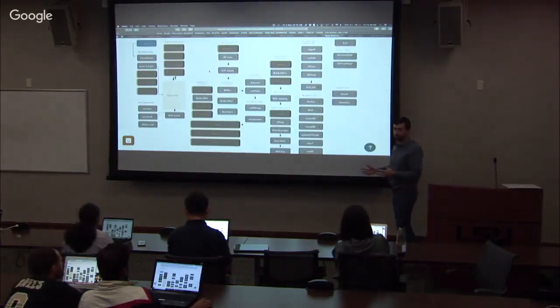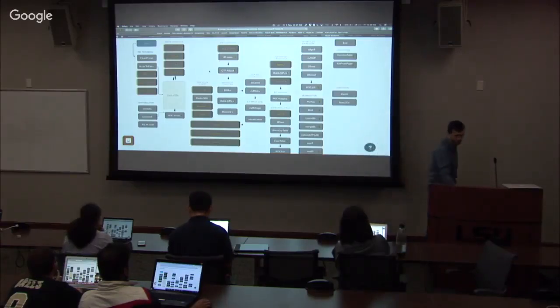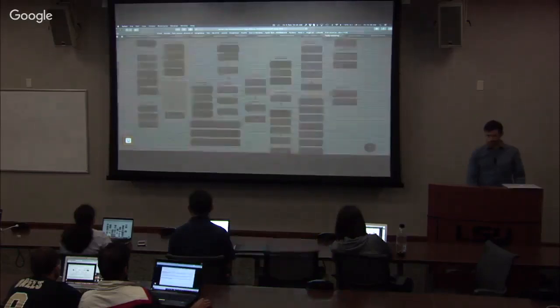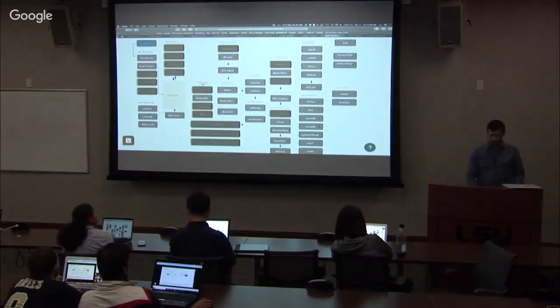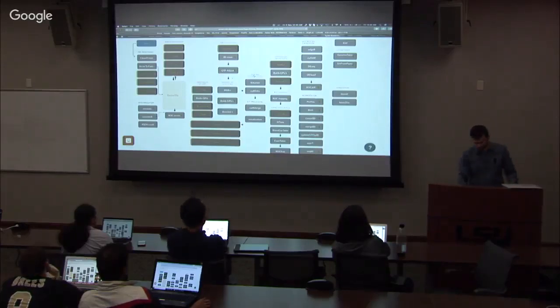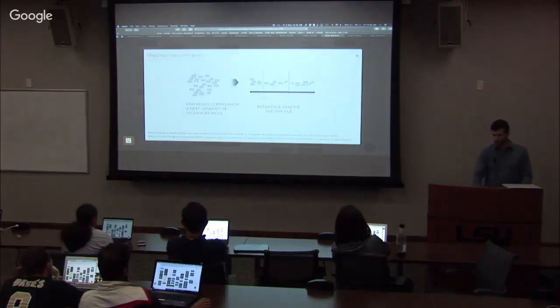So you can probably remember the colors that we used, right? We have blue for pre-processing, which is right here, pre-processing. And you can click on that, and you can understand what that section does. And then if you remember, we had red, so mapping on genome, and all of the things that we talked about: exon detection, mapping on junction, isoform construction. So all of those things are your options, right? So again, you can, for example, click on mapping on genome or on genes.